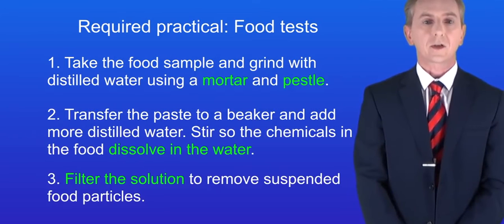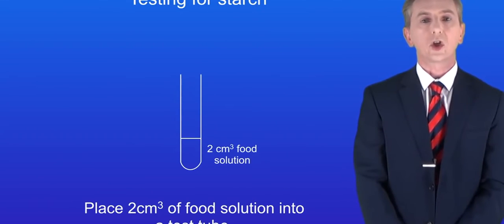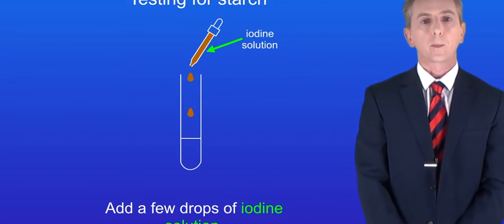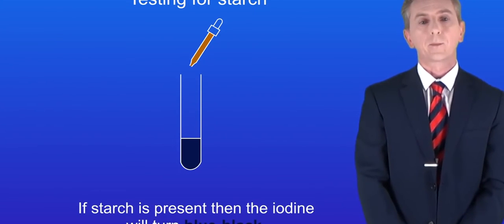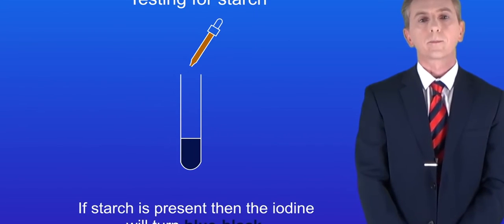We're going to start by testing for carbohydrates. This includes starch and also sugars such as glucose. To test for starch, we place 2 centimeters cubed of our food solution into a test tube, and we add a few drops of iodine solution, which is an orange colour. If starch is present, then the iodine will turn blue-black. However, if there's no starch, then the iodine will stay orange.